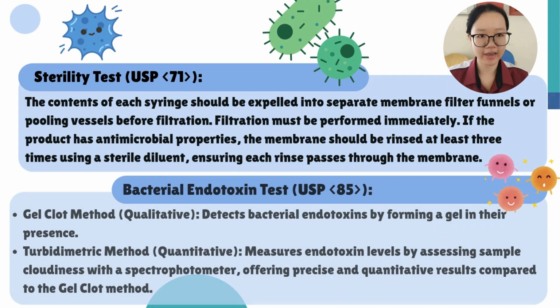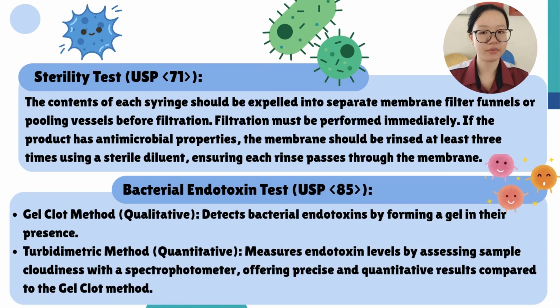Moving on to the sterility test, as outlined in USP Chapter 71, this test ensures that parenteral products like injections and infusions are free from any viable microorganisms. For a sterile syringe, the contents should be expelled into separate membrane filter funnels or pooling vessels, and filtration must be performed immediately to maintain sterility.